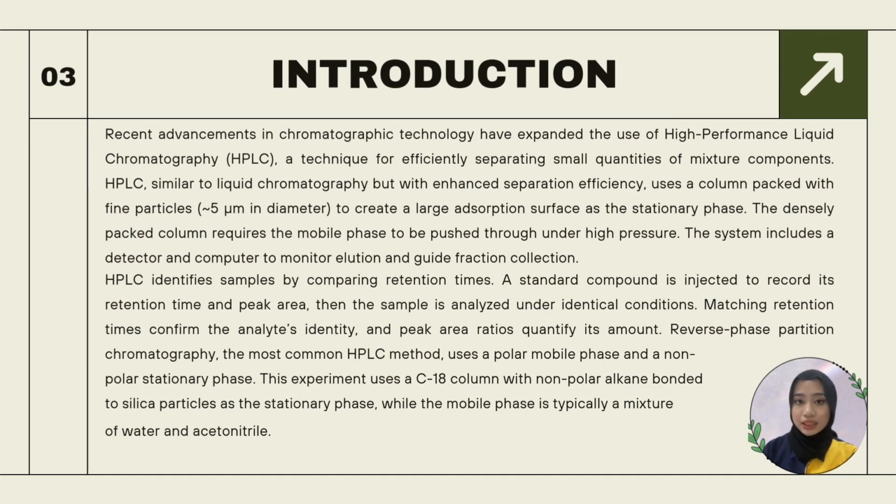Recent advancements in chromatography technology have expanded the use of high-performance liquid chromatography (HPLC), a technique for efficiently separating small quantities of mixture components. HPLC is similar to liquid chromatography, but with enhanced separation efficiency.